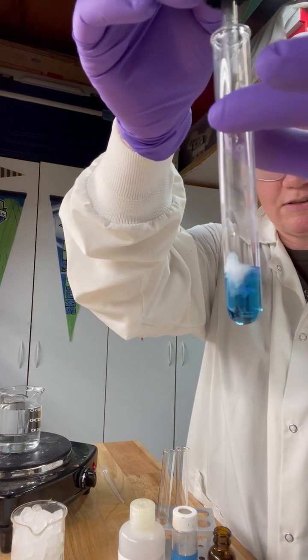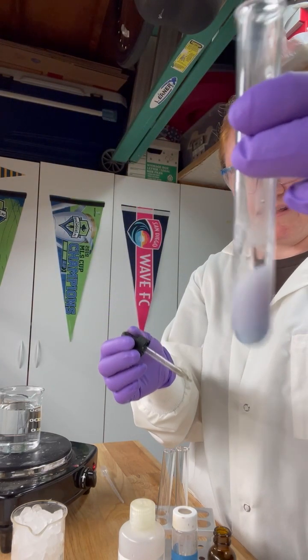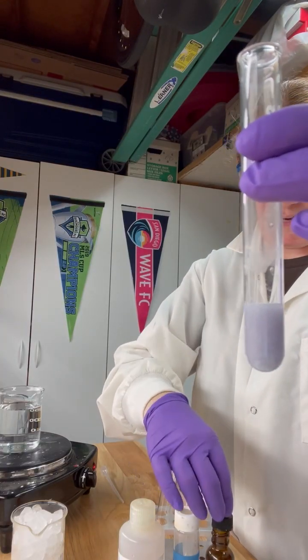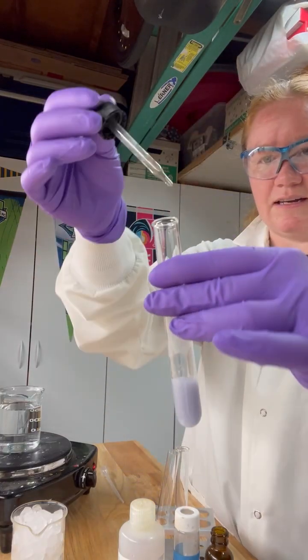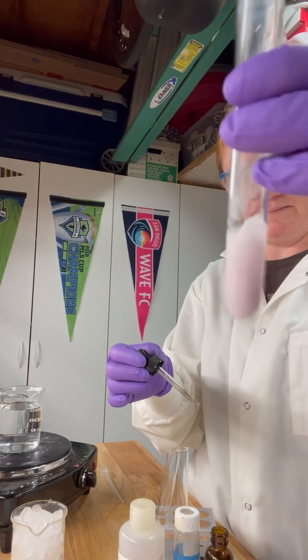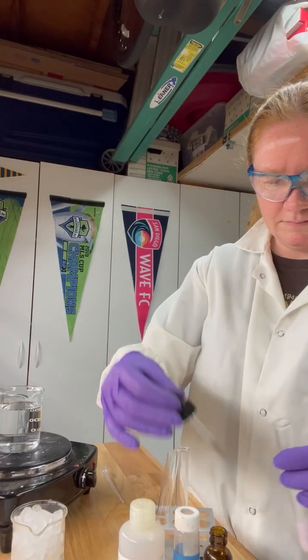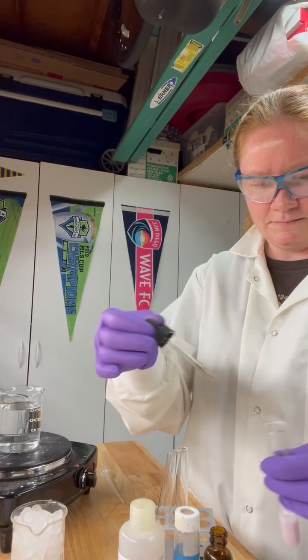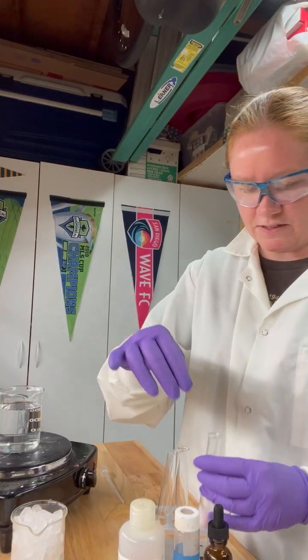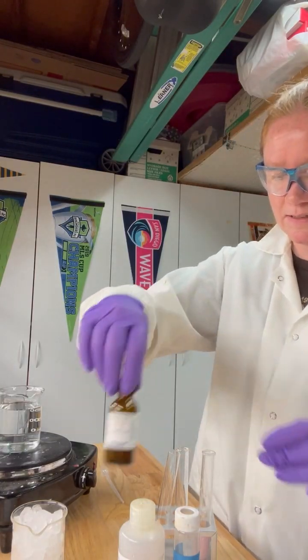So let's go ahead and drop in our silver nitrate. So there you go. You can see that we're getting some return to pink, and we are getting a solid precipitate. Okay. All right. So now we've shifted our equilibrium back toward our reactants.